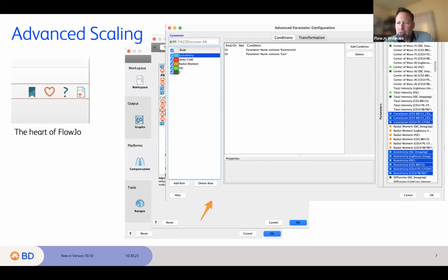So it's a possibility. You can have everyone auto scale, or you can set in more specific defaults that will line up, fingers crossed, just right with a given cytometer. My voltages are going to be relatively consistent, and the range and ability of this cytometer is pretty consistent over time. So fingers crossed, a set of preferences, especially if we can get them down to the individual parameter level if you want to, should be pretty good just consistently. So you have both possibilities actually. All right.